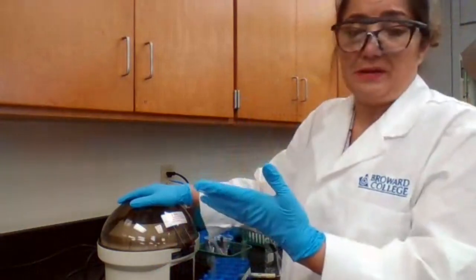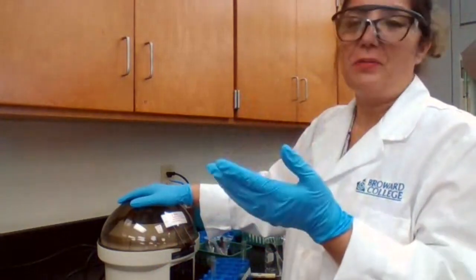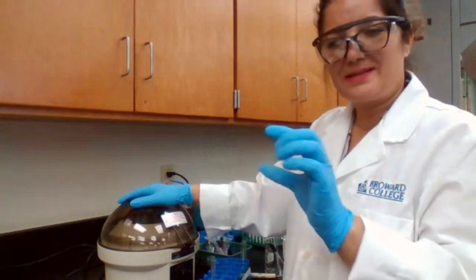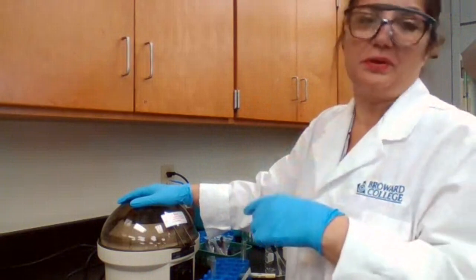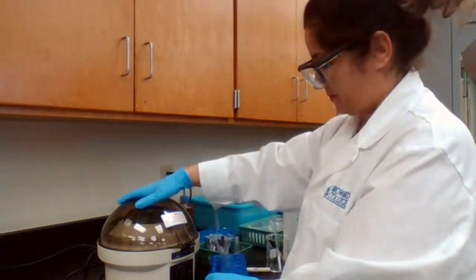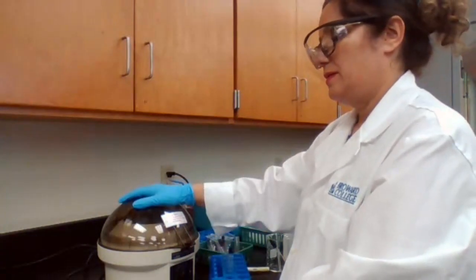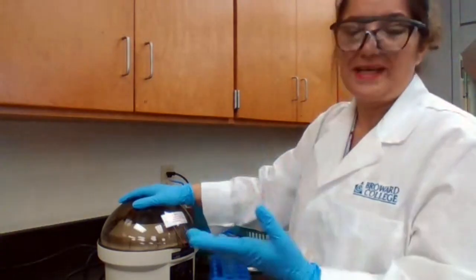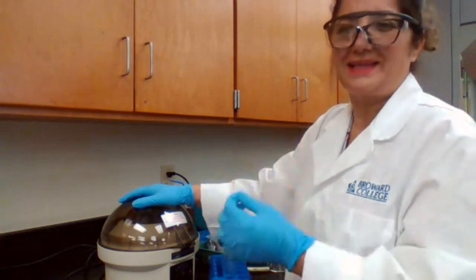The 30 seconds is not a fixed number. If I take it out and the top, the supernatant, is not clear, I have to put it back. That's why it's qualitative analysis.